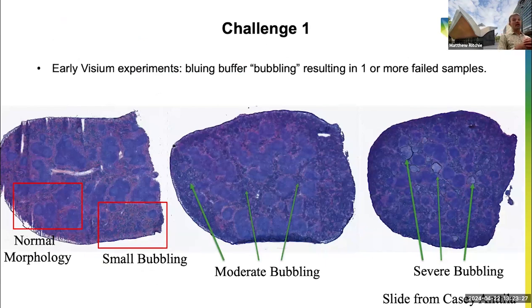So when we make RNA cocktails with all the spike-ins, it's pretty easy to make the reference sample, make enough of it, make more of it if you need to. For this sort of benchmarking, actually getting good data was the first challenge. There's quite a steep learning curve to being able to generate good data.